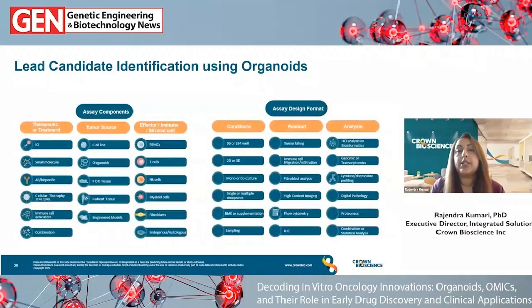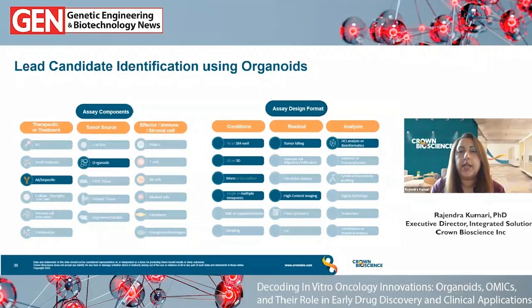So the next example actually is a very good demonstration of how fast and efficient organoid screening can be, and also that you can include antibody screening into these study designs. So this was using treatment with a range of different bispecifics in colorectal cancer organoids in a high throughput manner in multiple time points to assess phenotypic response via high content imaging, and also potentially identification of biomarker response.